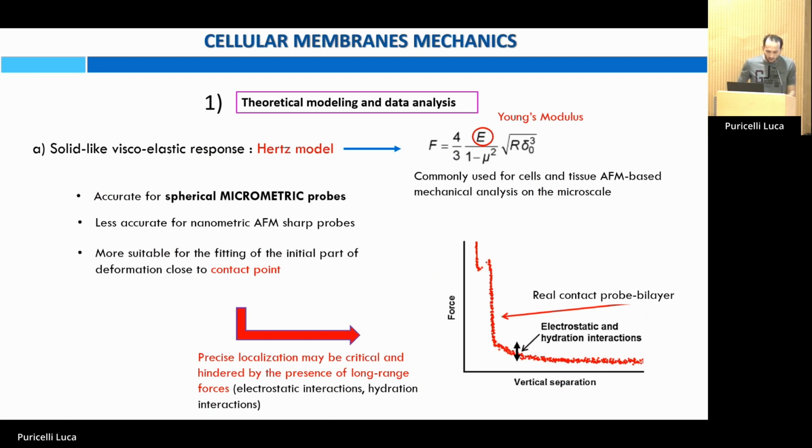Whereas on the other side, if we use the more common Hertz models typically used for cells and tissue, on the micro scale, it's one matter.